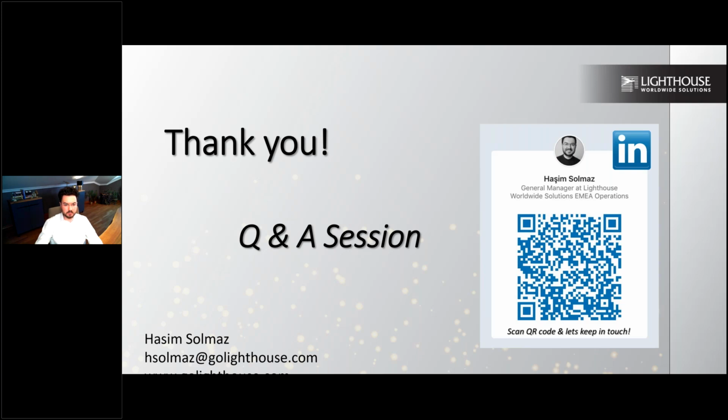Okay, what is the culture media? We have an answer to your question. Mr. Alper Sarı answered your question, and he said that tryptic soy agar, TSA, is the best approach to use as your media for yeast and molds. Okay, good. Thank you, Alper Bey.